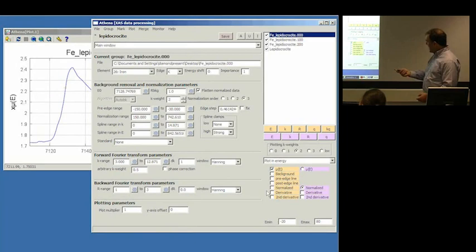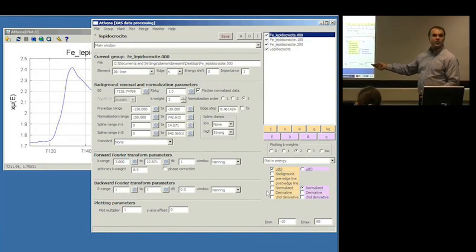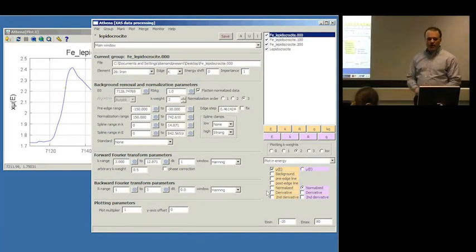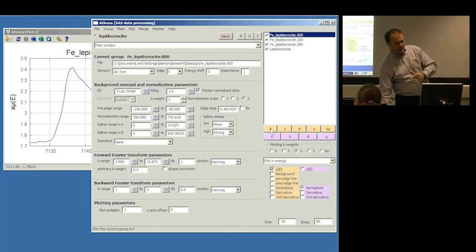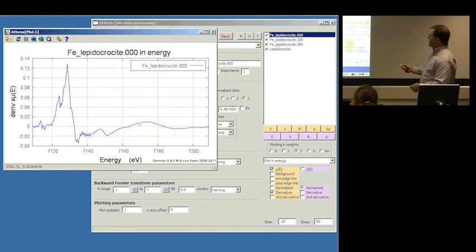That thing that I pointed out a second ago is actually right here, the inflection point of the pre-edge feature. And it tries really hard not to pick the pre-edge inflection point or the pre-edge peak in the first derivative. It tries really hard to find the peak of the biggest peak in the first derivative. But the way the algorithm is implemented, it tends to overshoot by a little bit. So typically, the default in IFEFFIT is 1 or 2 points above the first peak in the first derivative. And that's how it works out in practice normally.